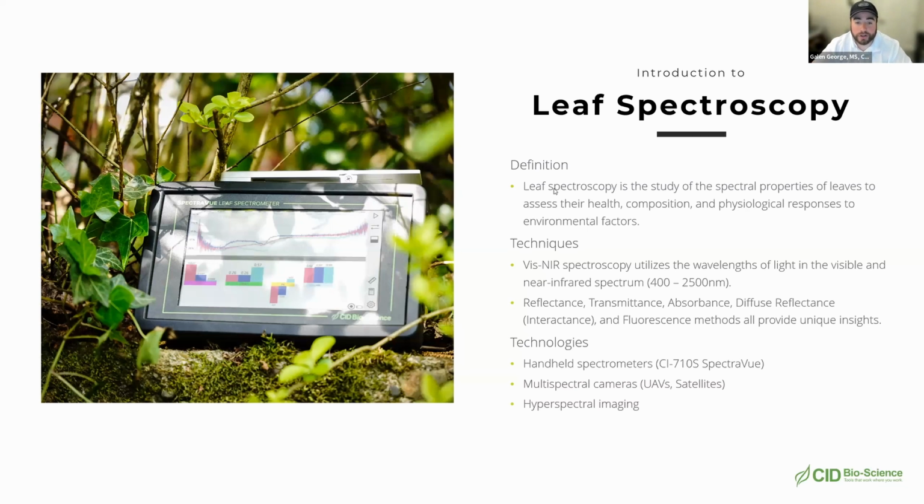There's a great question. Can you tell a bit more about the use of this device in the cannabis industry? Has there been research published specific for cannabis? So I think the cannabis industry is still just starting to get into the spectroscopy stuff. With this specific spectrometer, with the wavelength range that we have, I can tell you that depending on what the application is, I immediately went to thinking of cannabinoid profiles.